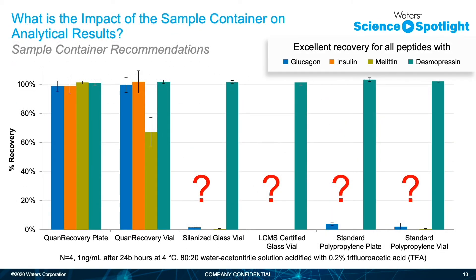Nonspecific binding is a complex phenomenon. Let's take a look at four therapeutic peptides placed into a variety of different sample containers: glucagon, insulin, melittin, and desmopressin. Glucagon and melittin are both very hydrophobic, insulin is on the larger side, and desmopressin is fairly easy to separate and quantify. We've placed them into the Quan Recovery plates and vials, various glass vials, and various polypropylene plates and vials.